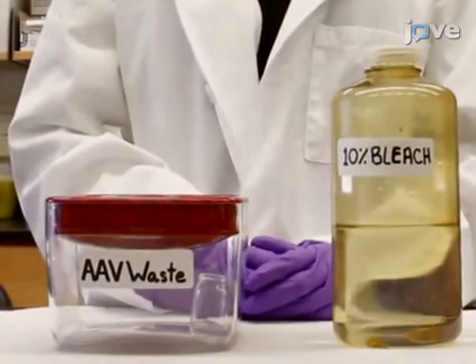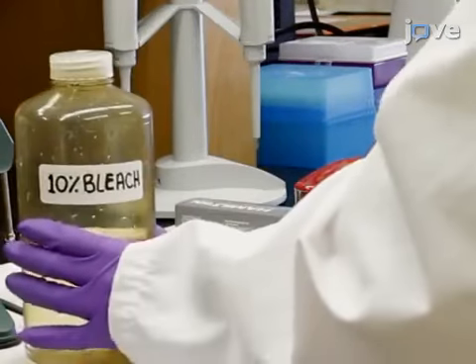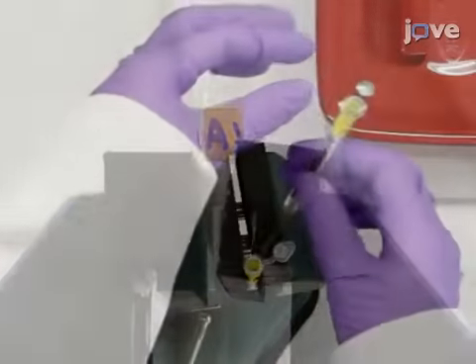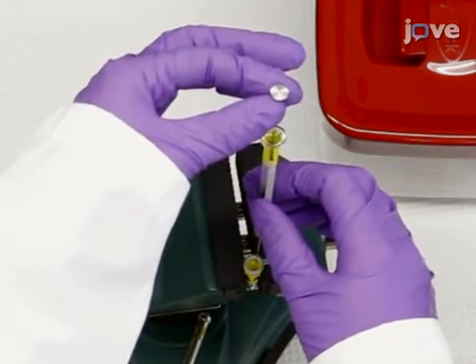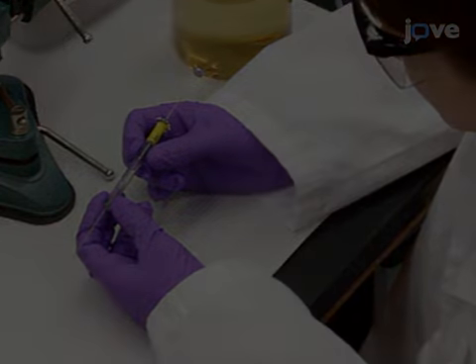Place a beaker containing bleach solution and a sterile 10 microliter syringe in the workspace. Place the microcentrifuge tube containing an aliquot of AAV into a standard bench vise. Load a 10 microliter syringe with at least 4 microliters of AAV. Ensure that there are no air bubbles in the 4 microliters of AAV solution in the syringe.